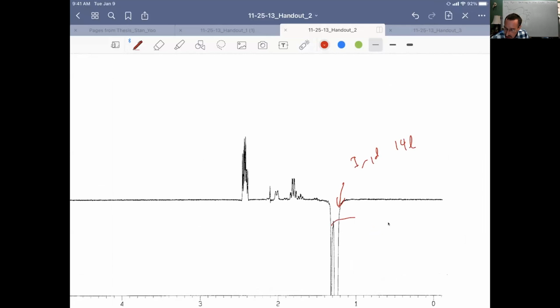but you notice we don't get complete selectivity. In general, in the NMR and in a 1D NOE spectrum, it's very hard to hit one peak selectively when it's within about a tenth of a ppm of another group.